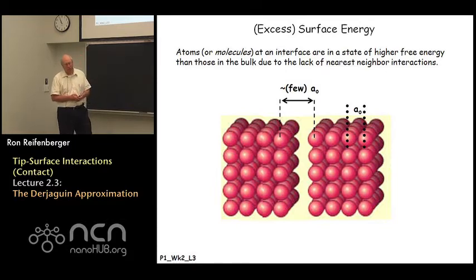And the question now becomes, if these two surfaces interact, one with respect to the other, strictly by a van der Waals force, what is the net energy of attraction that these two surfaces would have when we're considering planar surfaces? Before, we considered the case of a sphere interacting with a flat plane; in this lecture we're more focused on two flat planes interacting one with respect to another.